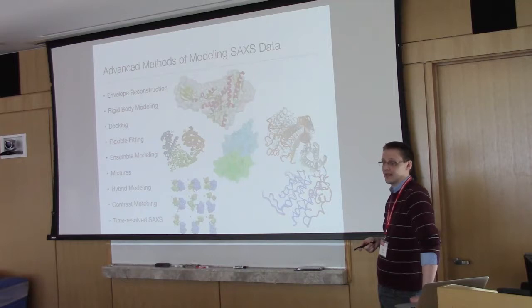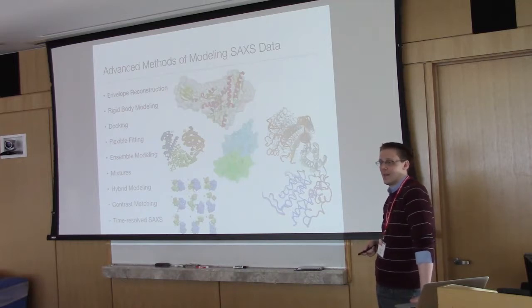So, yes. Suppose you have a protein that's almost symmetrical and has 2 helices. And if you have an envelope for that, how will we determine which orientation is right for it?